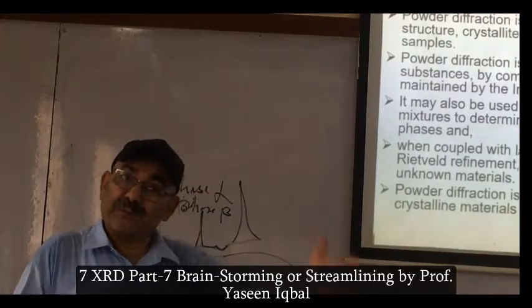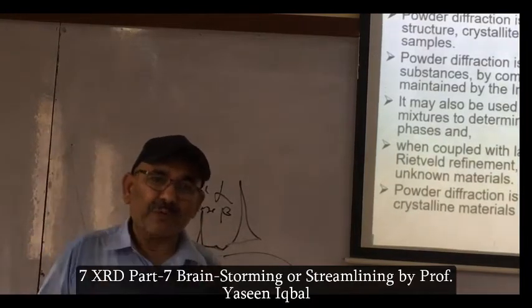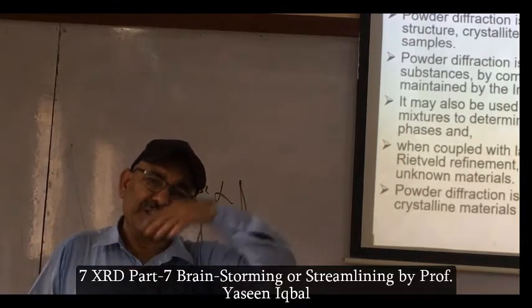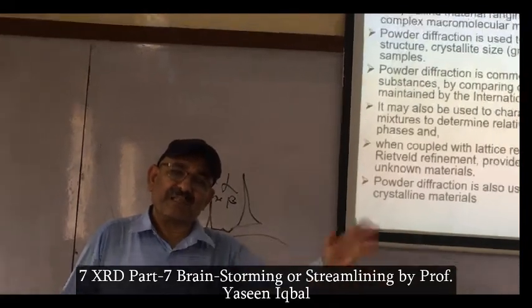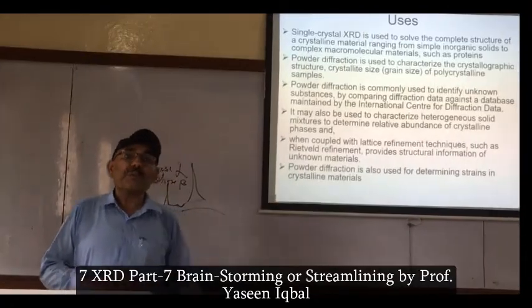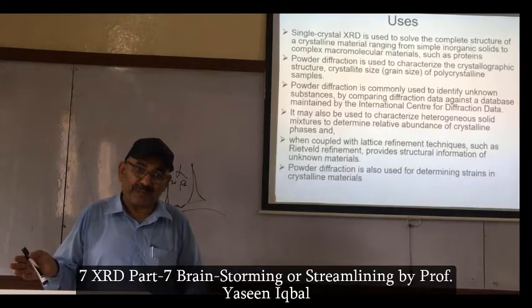So the intensities will obviously be different. Similarly, the electronics which are converting your data from digital to analog and analog to digital, some things are lost or disrupted there as well. So people rely more on the theory in comparison to the experiment.